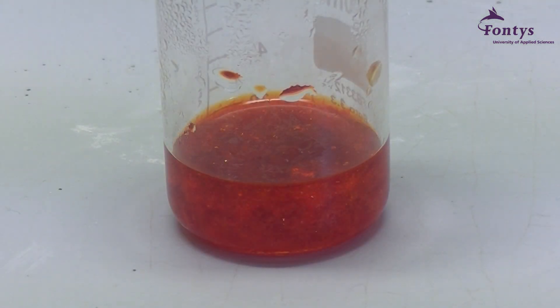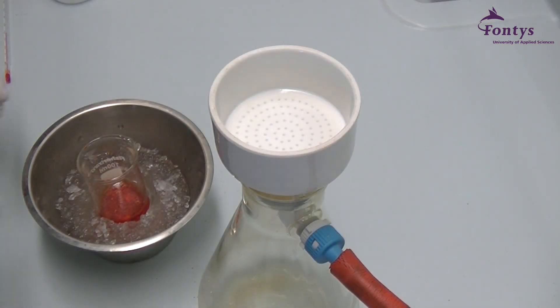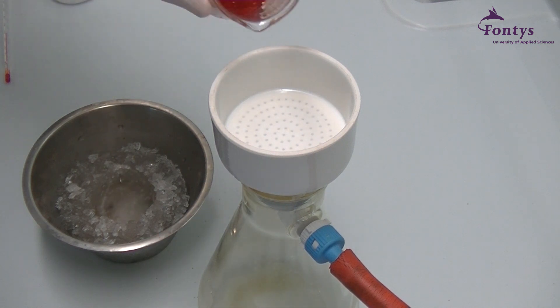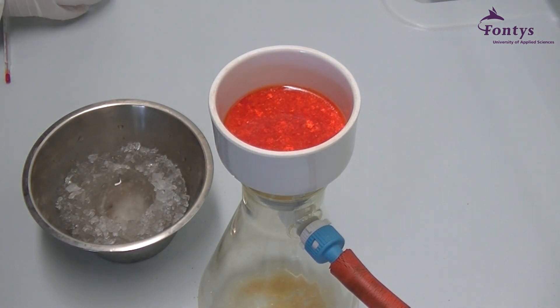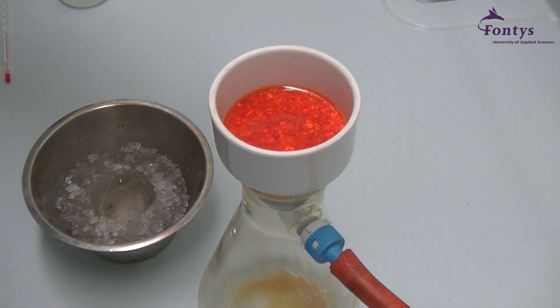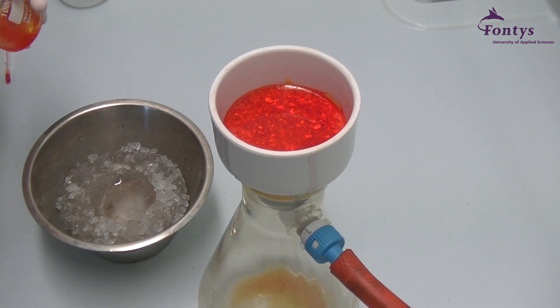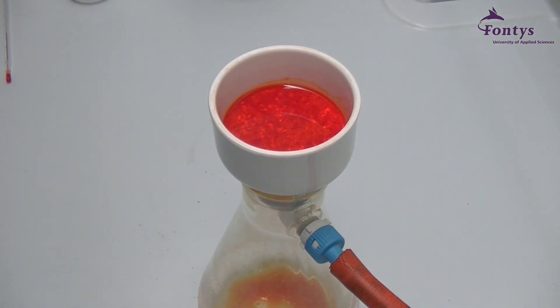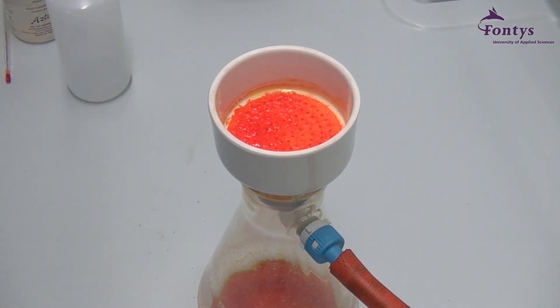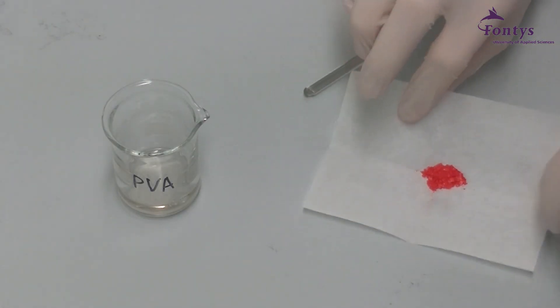This is what the solution should look like when all crystals are precipitated. Next, the ruthenium complex crystals will be filtered using a Buchner funnel. Flush out the remaining solution with as little cold ethanol as possible. Dry the crystals overnight at 80 degrees Celsius.